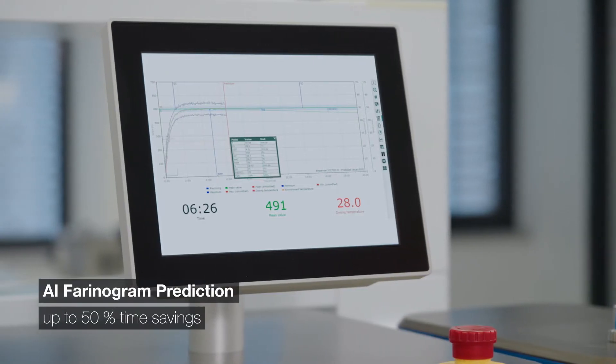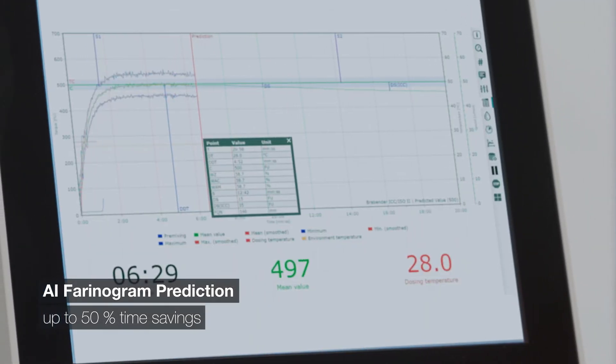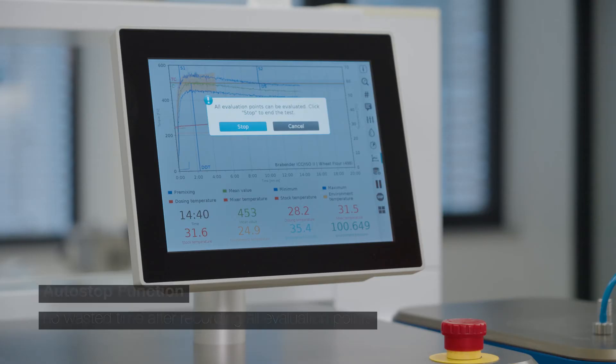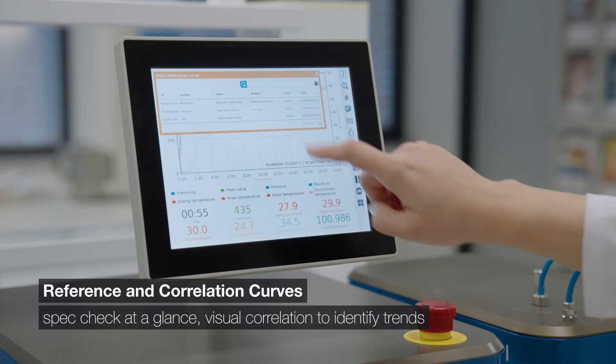Harness the power of AI-based Farinogram predictions to minimize operator time by up to 50%. The MetaBridge auto-stop function makes sure no time is wasted as soon as all selected evaluation points are measured.